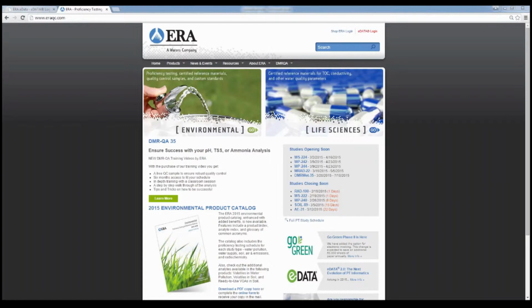Our first presentation focused on how to navigate the eDATA site and the process to enter your data and complete an open study. Our second presentation focused on reviewing your results after a study has been completed and evaluated and looked at some of the enhanced tools for QA managers provided in eDATA 2.0.